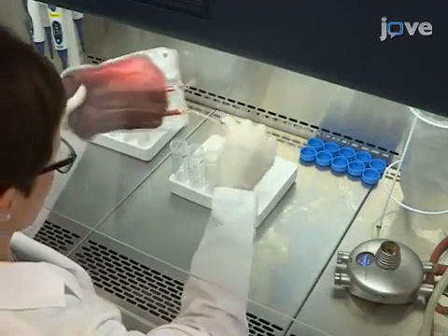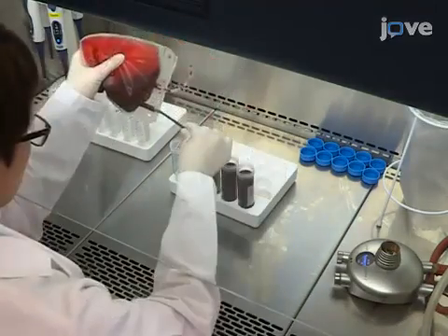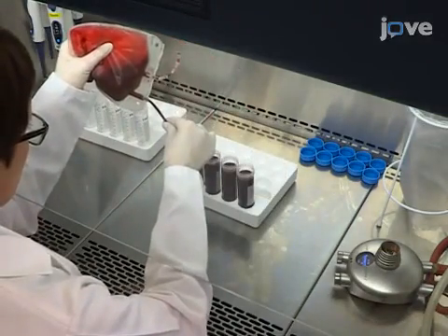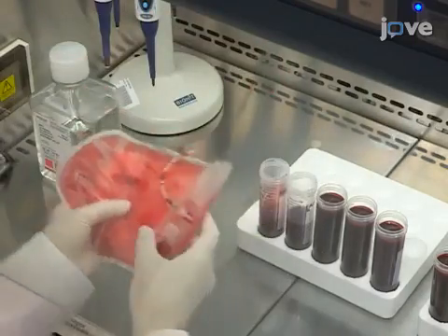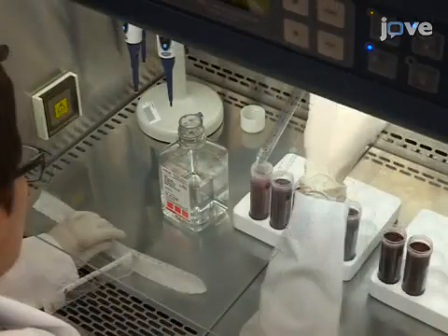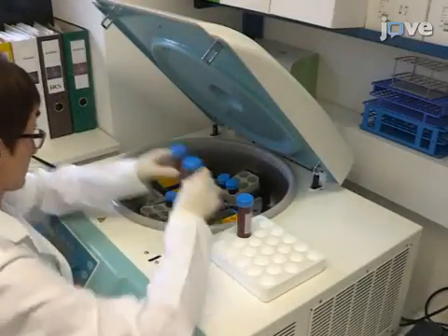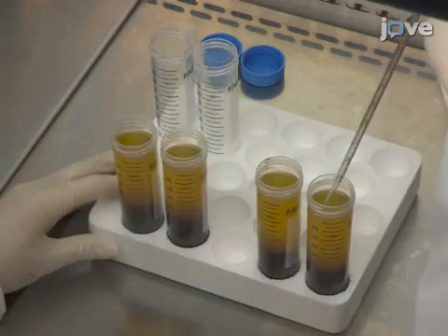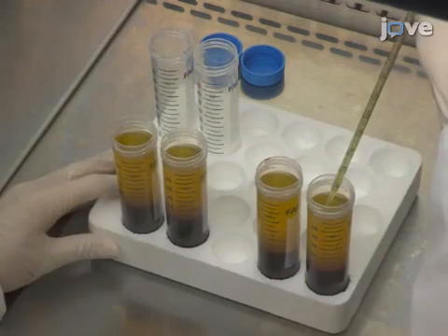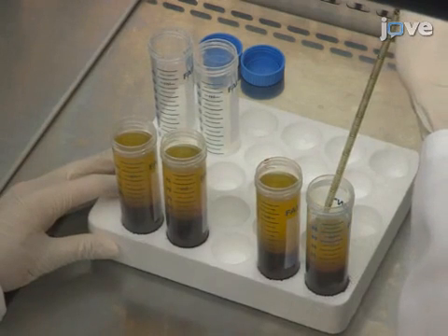Begin by splitting the blood pack volume among sterile 50 milliliter centrifuge tubes according to the amount of blood received. Adjust the final volume in each tube to 50 milliliters with sterile Dulbecco's PBS as necessary and centrifuge the samples. Using a sterile 1 milliliter serological pipette connected to a laboratory vacuum pump, remove the upper plasma and platelet layers, leaving the boundary layers undisturbed.